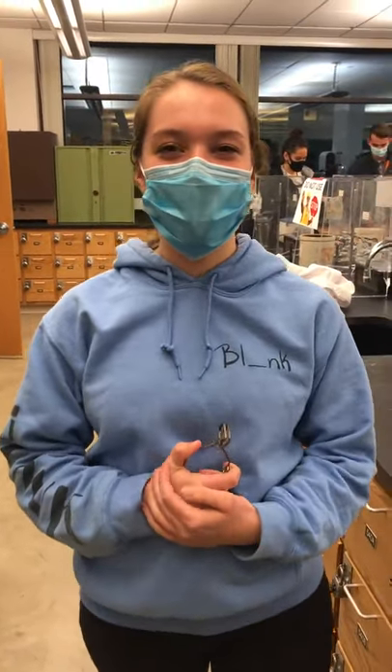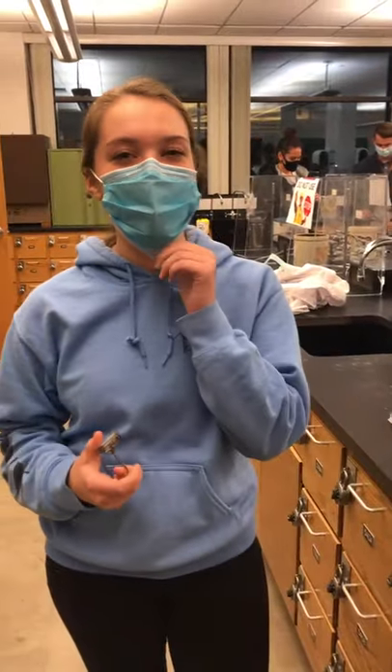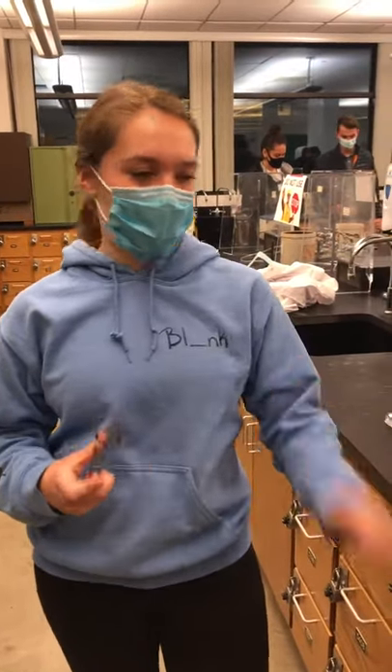Hi, I'm Elizabeth Williams and I'm in section 5 with Trent Gibson, and I'm going to be showing you how to heat a test tube with a Bunsen burner.